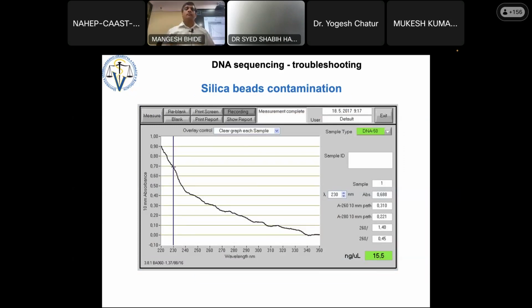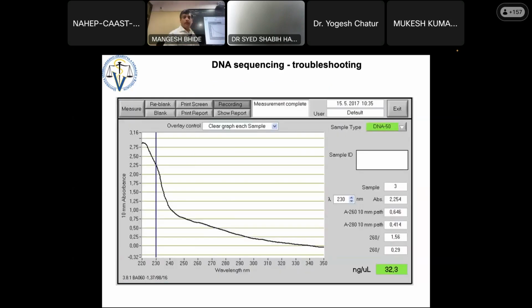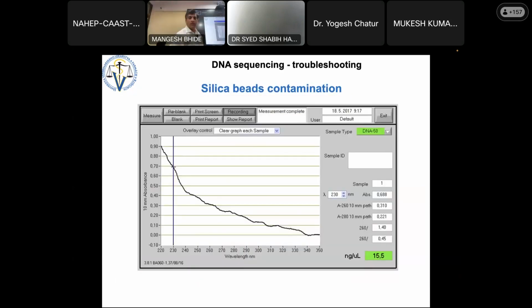And this picture is again, now you can compare this. Okay, for example, what I said, you have contamination over here, the concentration is 32, but see the graph, it is still okay. This graph is not dented. Here you see the graph is dented. It's like that. That means silica has come from the filter. So your filters are old. Okay, silica is old.